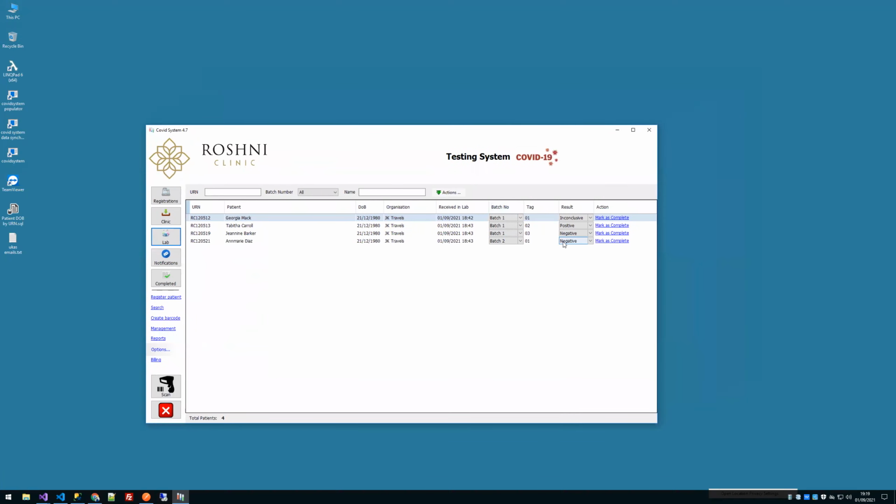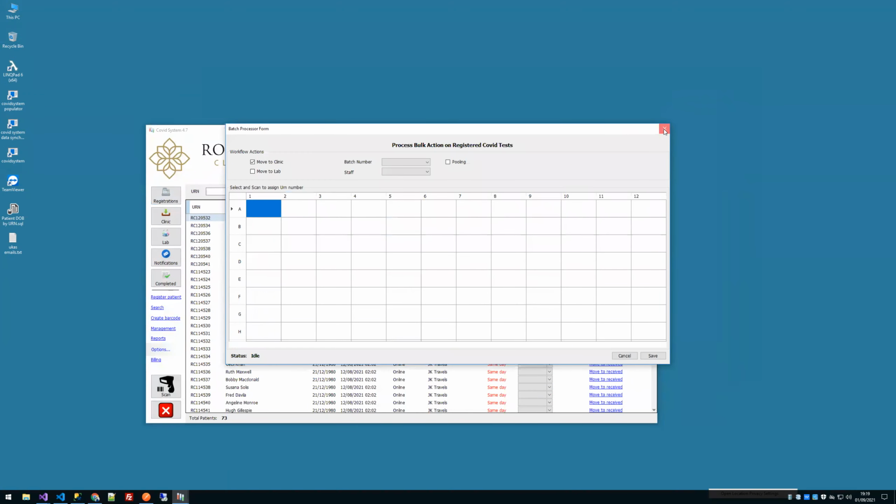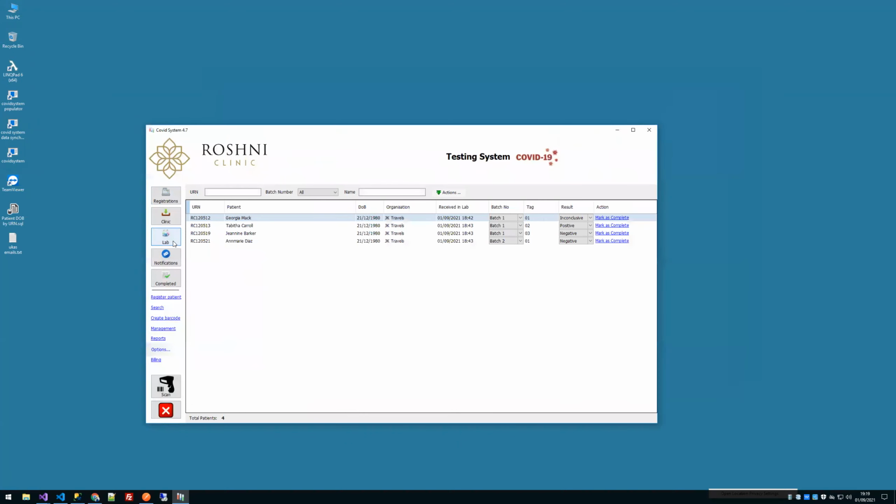On whether we want to do the batch processing, the pooling, that kind of stuff, that's all the lab functionality. It's just an easier way to assign, like scanning barcodes and assigning test samples to well numbers and so on. I can go through that with you. But the rest of the system, you've got a recording of it anyway, so you can show that to whoever's interested.